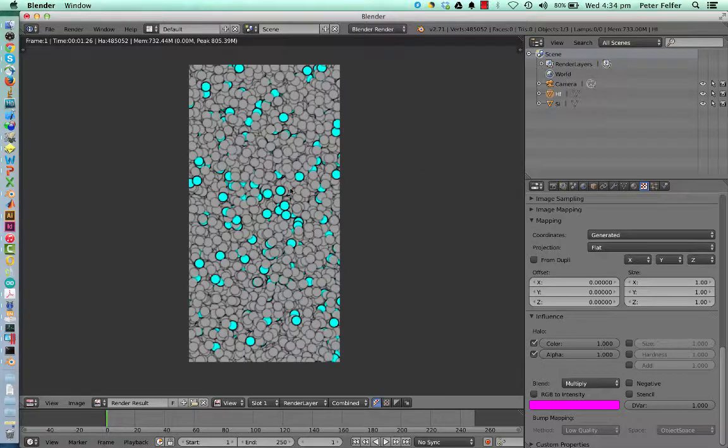Anyway, you can see that there's a contrast now between the atoms, and you're able to discern which one's which. It sort of looks a little bit like you've put coins on top of each other. But especially if you're after a sort of flat look, you can do cross sections and things like that. That can be very helpful.